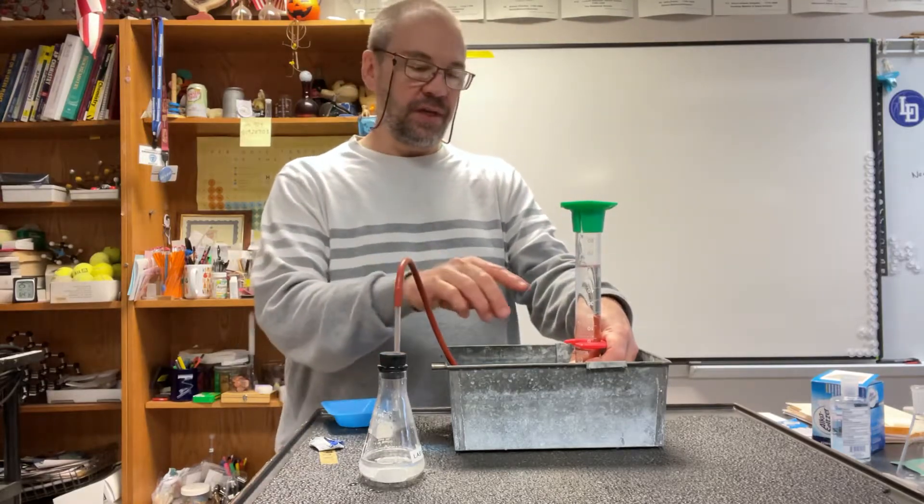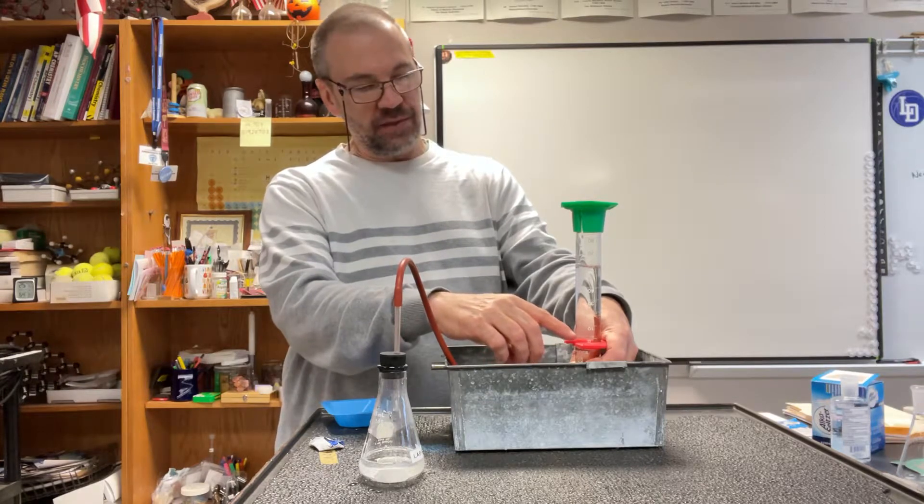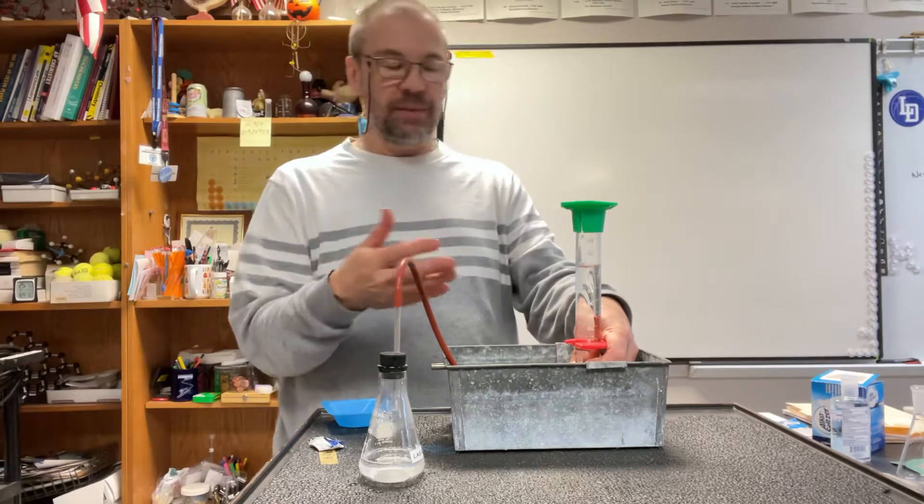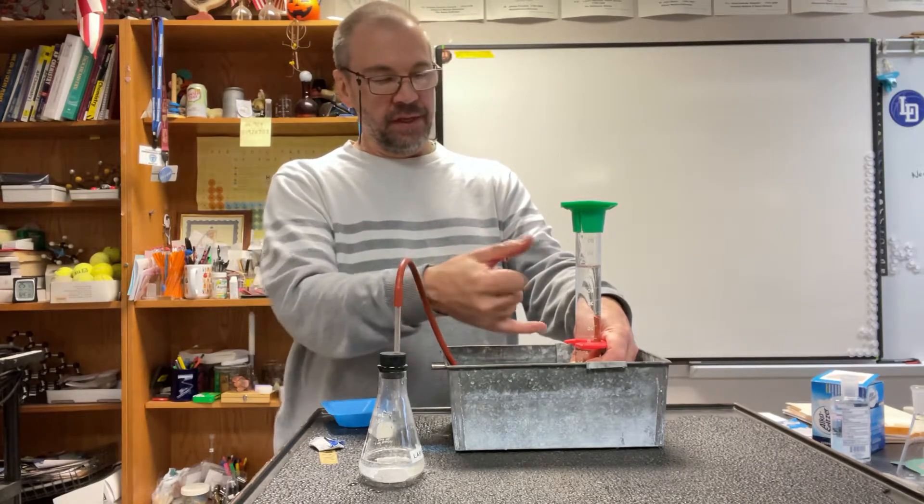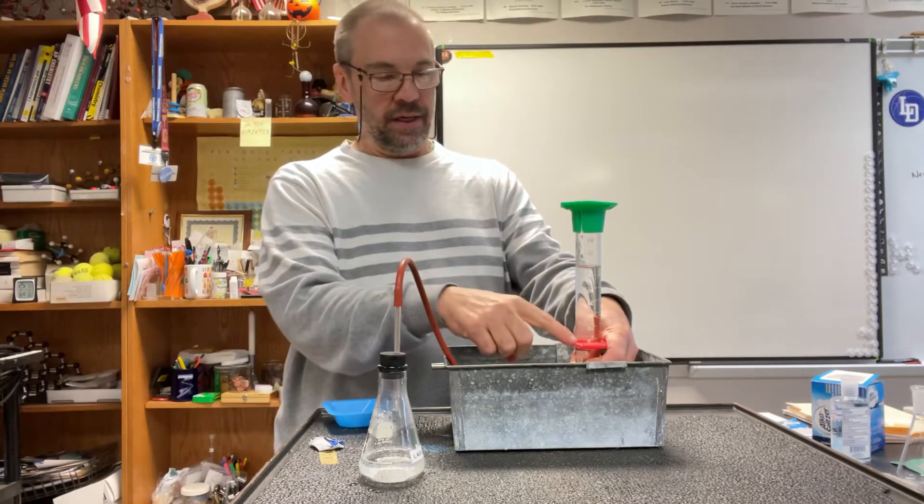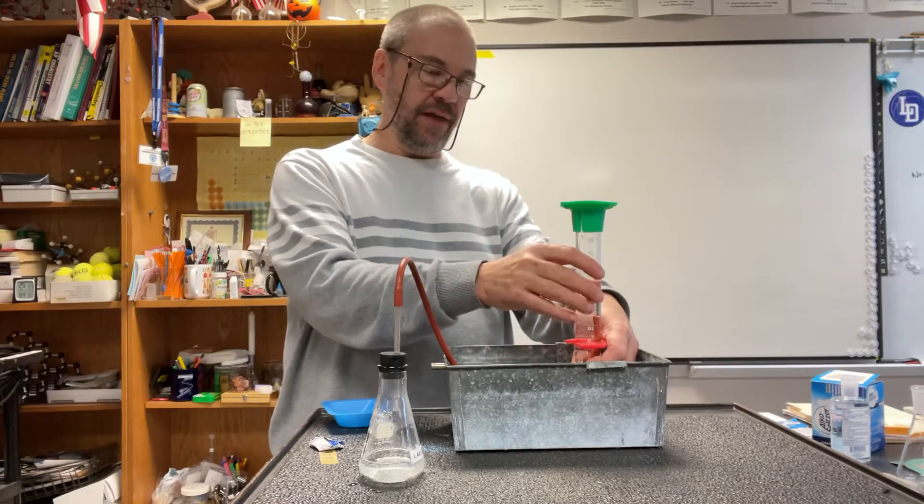What you want to do is use enough Alka-Seltzer to bring that level down as far as possible, but not going past the 100 mark, otherwise you won't be able to measure it. Then we're going to measure the difference between where we started and where we ended up, and that's going to be the volume of carbon dioxide collected.